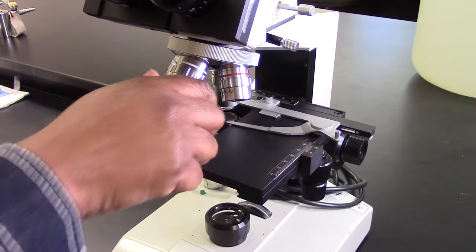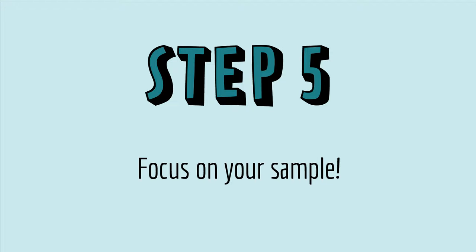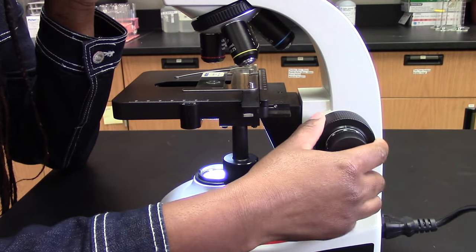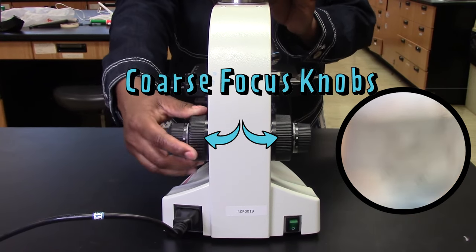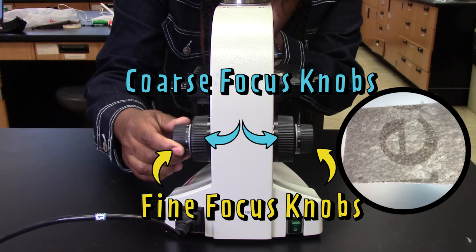Never turn the objective housing by grabbing the objective itself — you can damage the objectives. To focus on the slide, you have to change the height of the stage, which you can do using the focus knobs. In the beginning, when nothing is in focus, use the coarse focus knob, which moves the stage a lot. Once the image is slightly in focus, use the fine focus knob to get the image perfectly in focus.